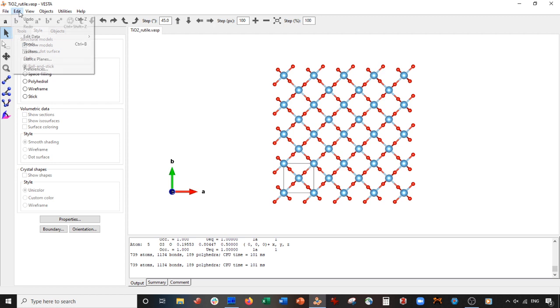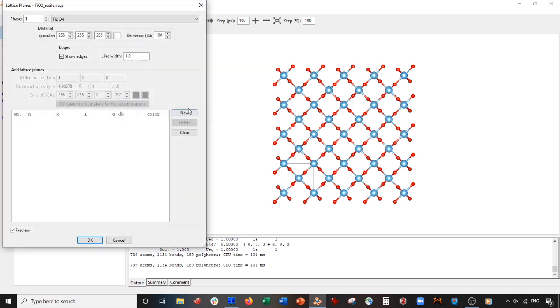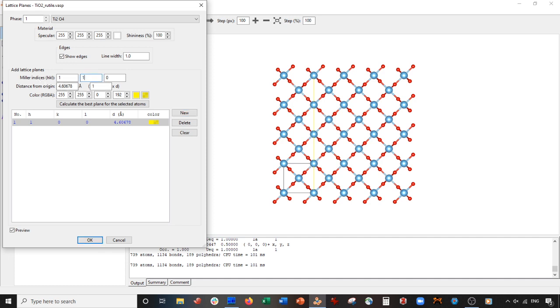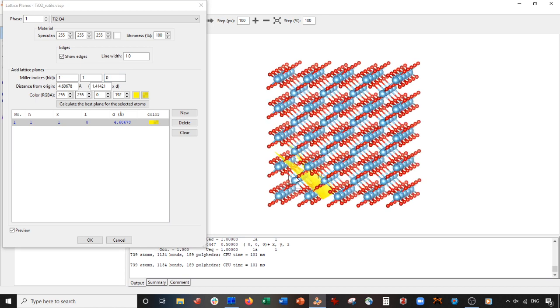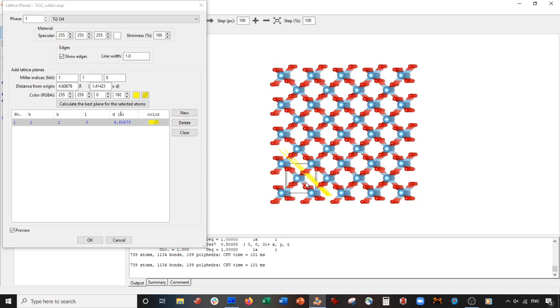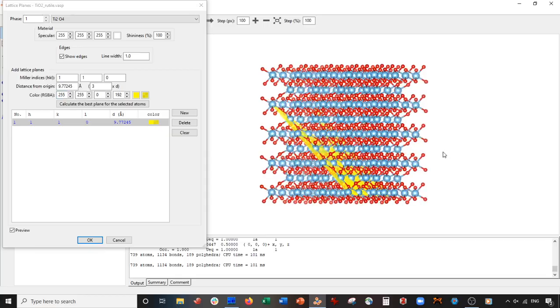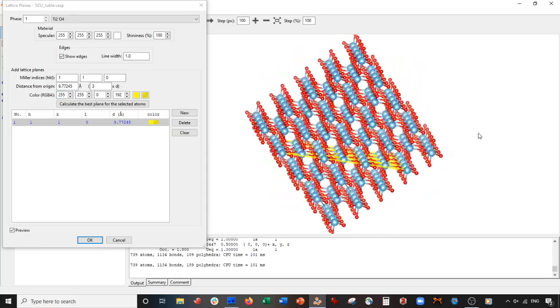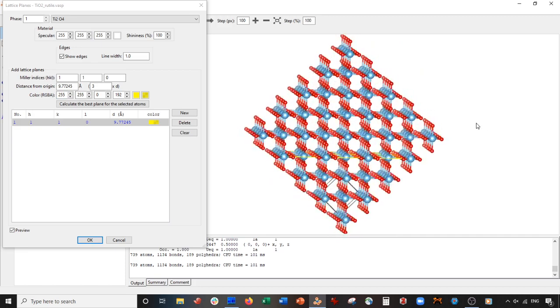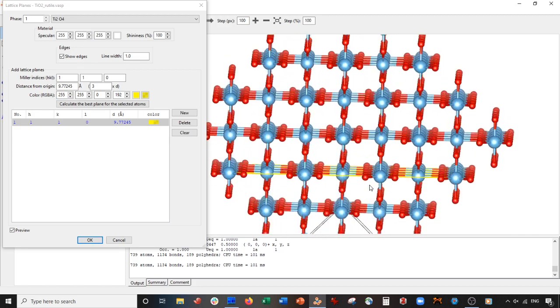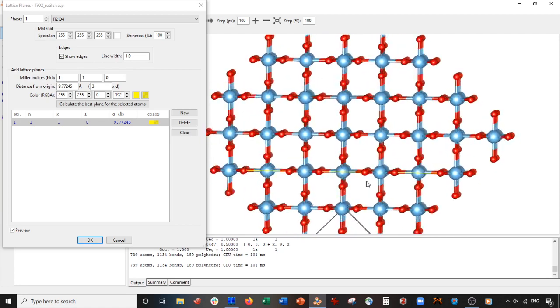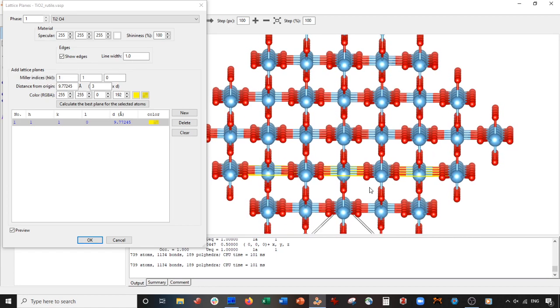Now what we're going to do is go to Edit Lattice Planes, click New, and we're going to make the 110 plane — press Enter. There it is. This plane is the 110 plane but it's not really in a good spot, so we're going to change the distance from origin. I'll make this a three, press Enter, and you can see this is now our plane. What's important now is to rotate it such that this plane is perpendicular to the screen.